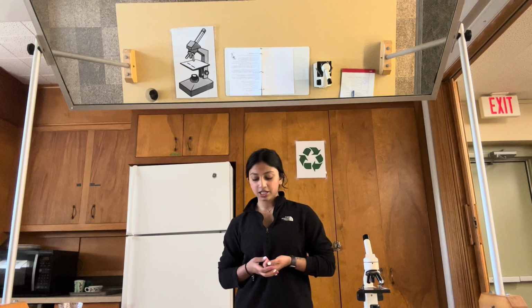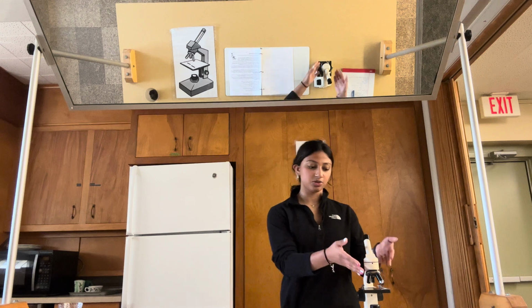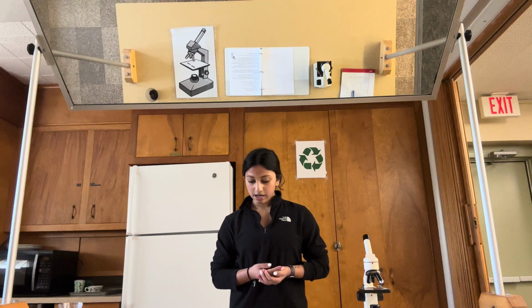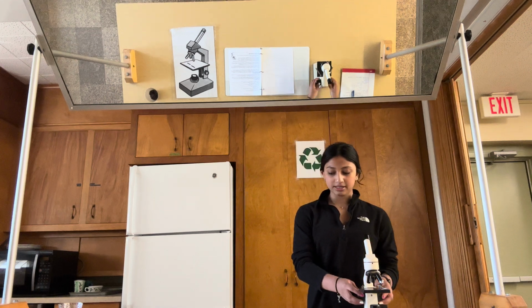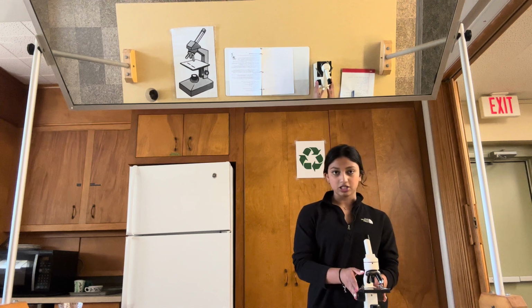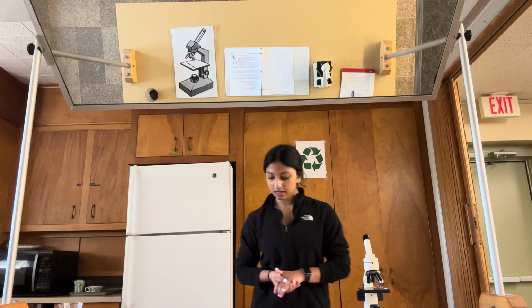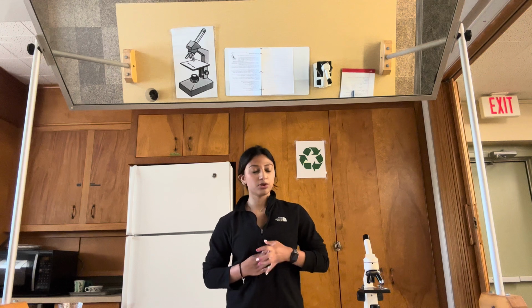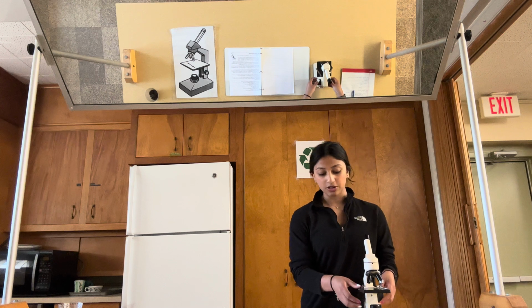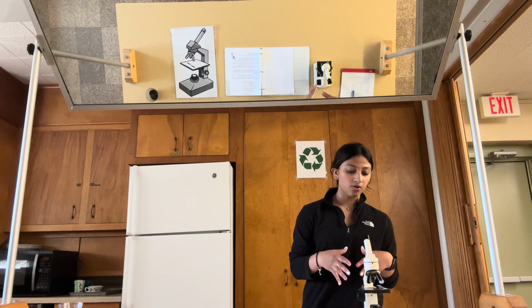The total magnification is the product of the eyepiece times that of the objective lens, which is where they get the 4x, 10x, or 40x. The coarse adjustment knob is the larger knob on the microscope. On these microscopes, there's only a coarse adjustment knob that adjusts the stage up and down. Do not use the coarse adjustment knob on the highest power setting because you can crack the lens or the slide.